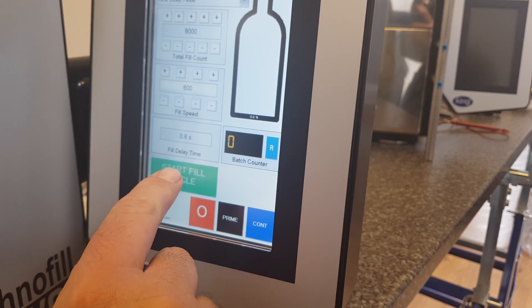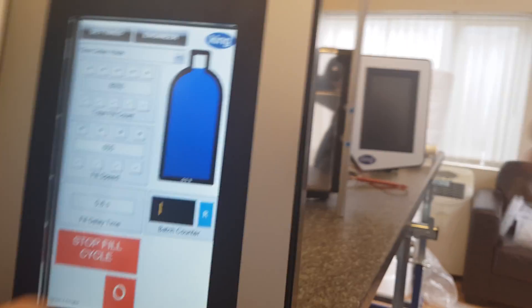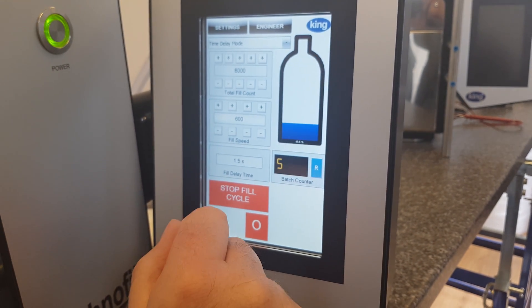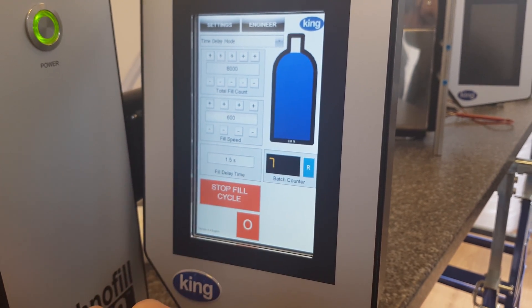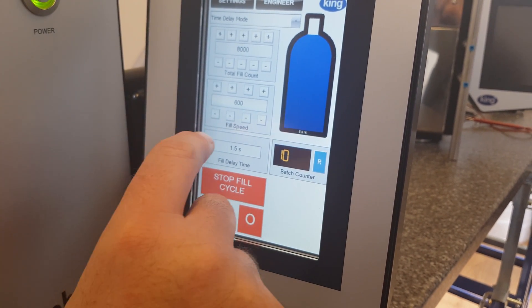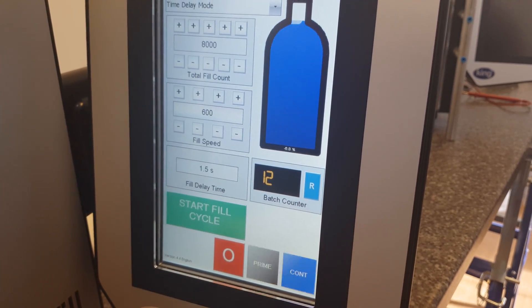So the machine, when we press the start fill button, will do one cycle and stop for 0.6 seconds. We can alter that and make it 1.5 seconds if we wanted — there's a gap. The time delay is for the time you need to change the bottles over. If you're a faster person at changing them over, you can increase the time delay. Then we have the fill speed and the fill count.